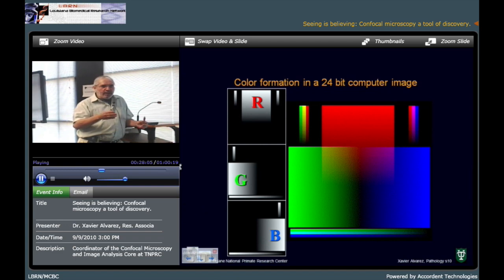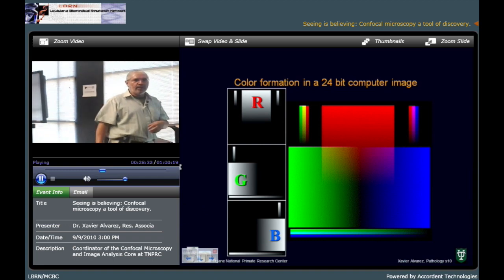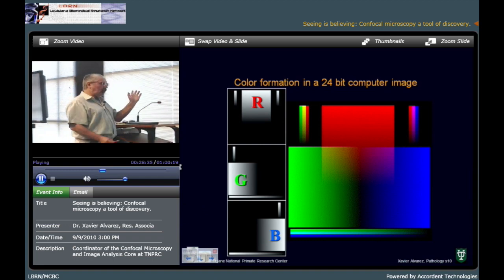A picture in a computer is like an Excel sheet where you have the location and the magnitude. That's a picture electronically. With 3 of them put together, we could generate colors. If we have only 2, then we get yellowish colors. And with the 3, we could generate all the millions of colors that you've seen on your computer.